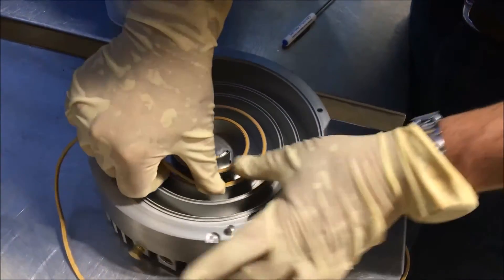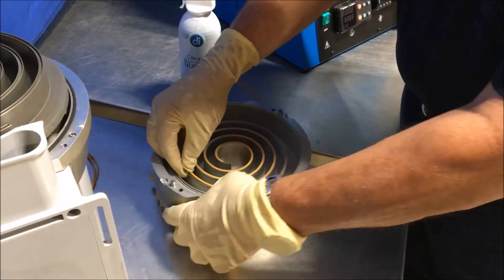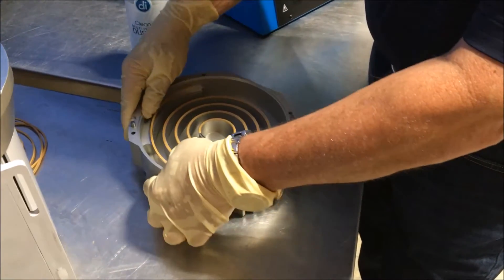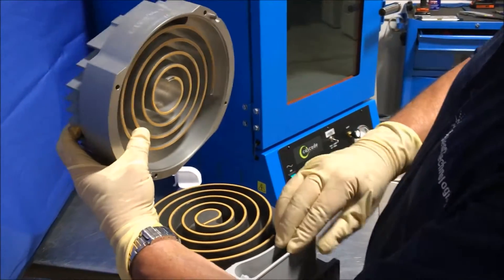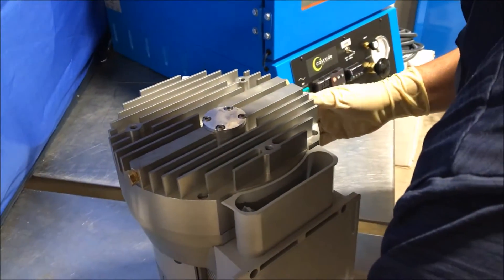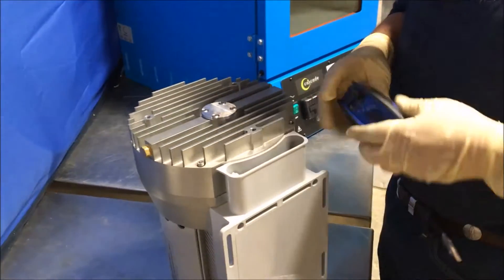Just feed the tip seal into this slot and run your thumb along it to hold it in. The serial number goes to the bottom of the pump — you'll see how the scrolls match up. Set that on, then add the four touch bolts and tighten.